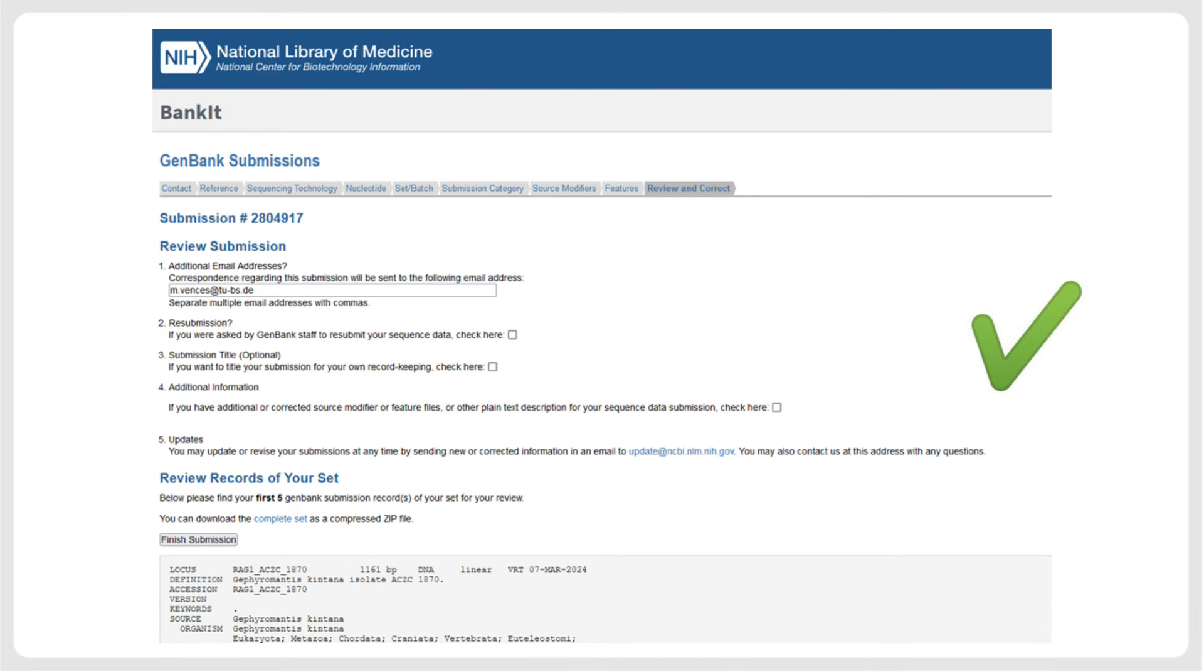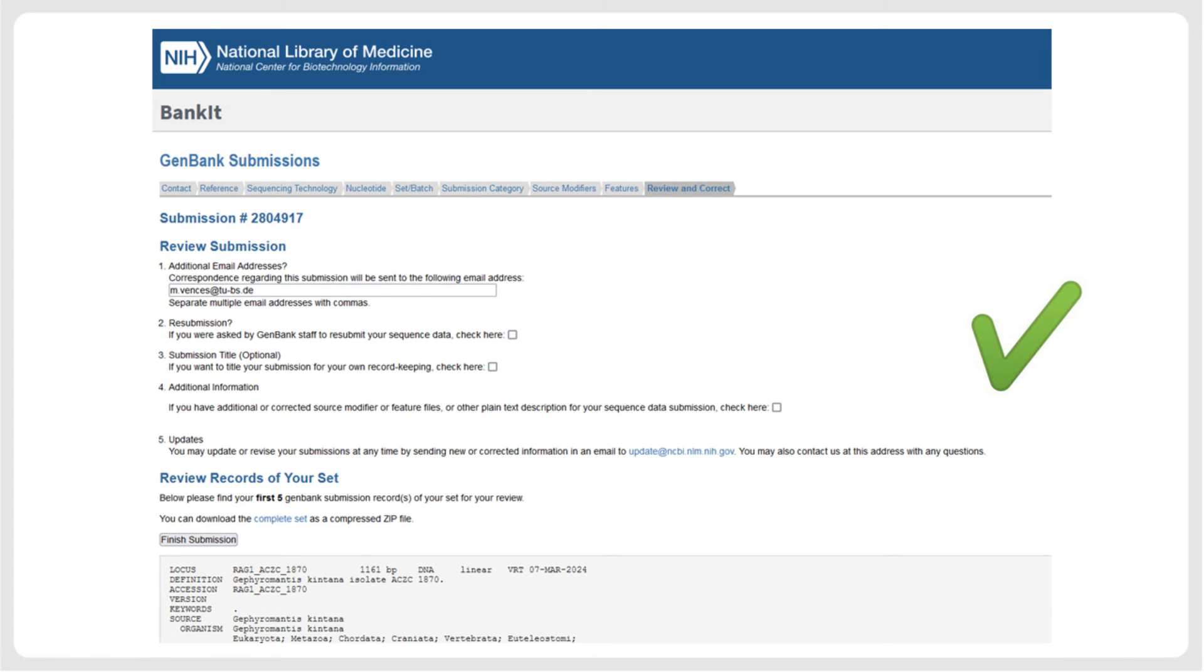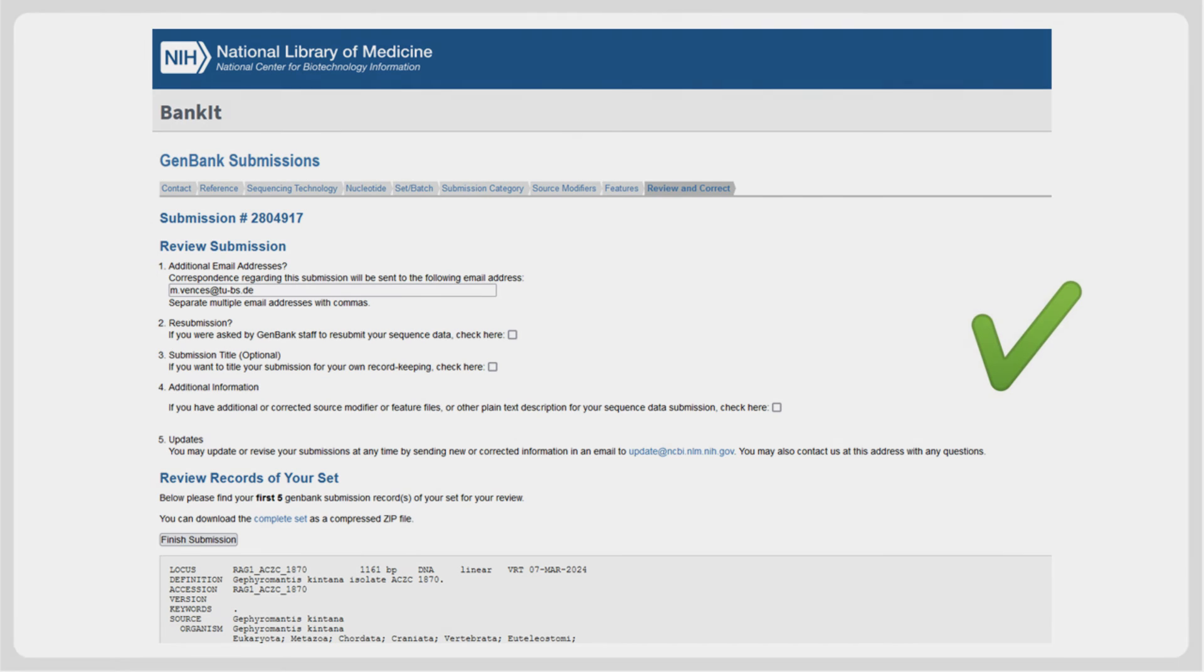Always keep in mind that there are other ways of preparing the data for submission to GenBank, and depending on your specific dataset, it might be easier to choose an alternative strategy. Additionally, NCBI is constantly updating and improving their submission pipelines, so some of the pages and procedures may differ from those shown here at the time you want to submit your own sequences. However, based on our experience with hundreds of submissions of taxonomic datasets, we recommend the strategy explained here for small to medium-sized sequence sets generated in taxonomic studies.